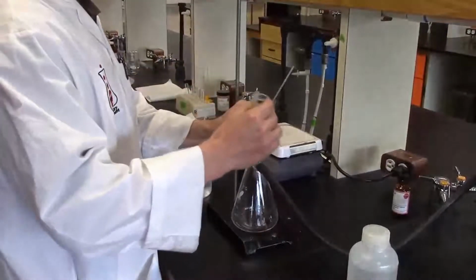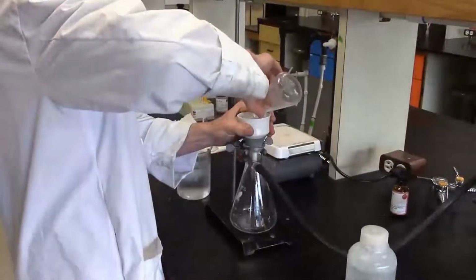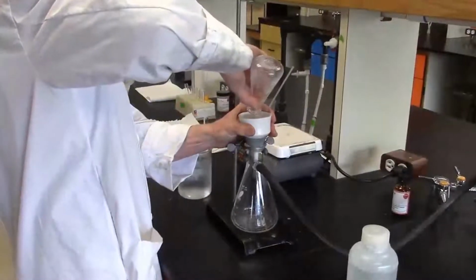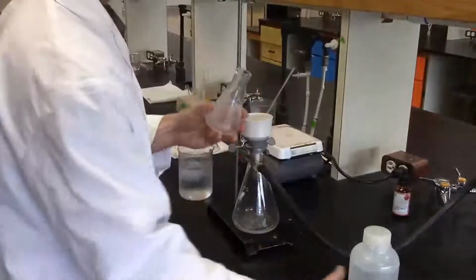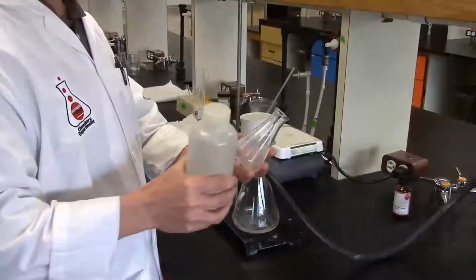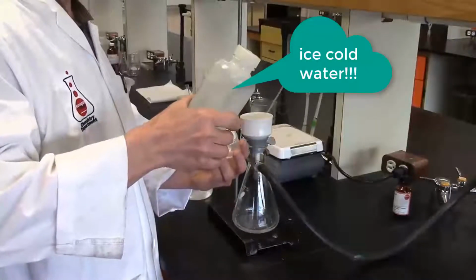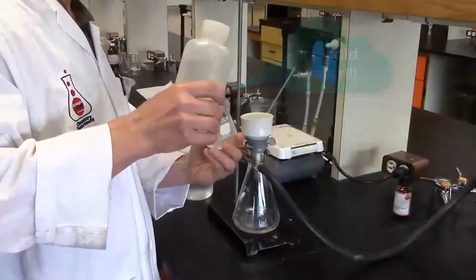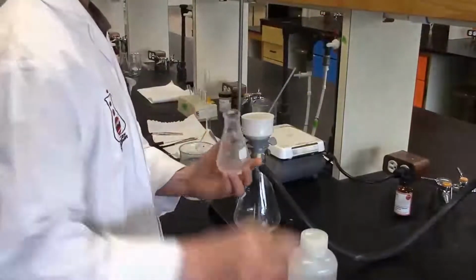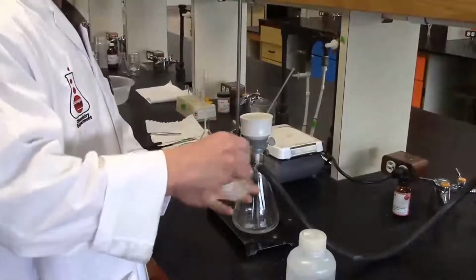Ready to transfer the slurry. I'm going to transfer fairly aggressively. So you want to get, of course, as much solid over as possible. Of course, there are some crystals remaining in the Erlenmeyer, so I'm going to squirt in, and I'm guesstimating maybe on the order of 5 to 10 mils. Just a couple of small washes.